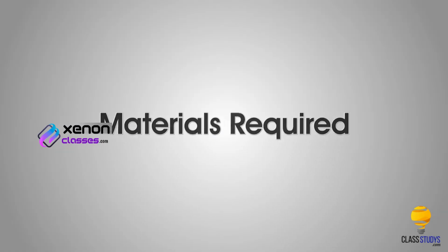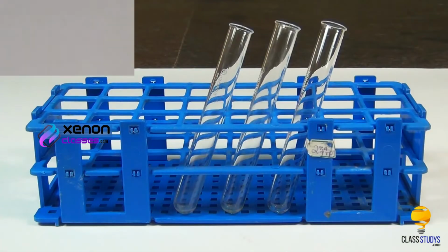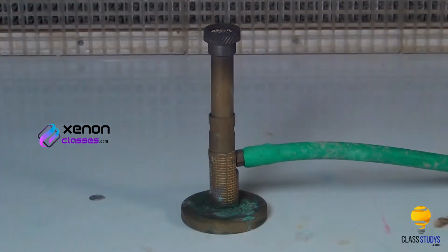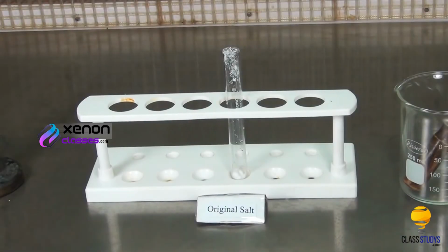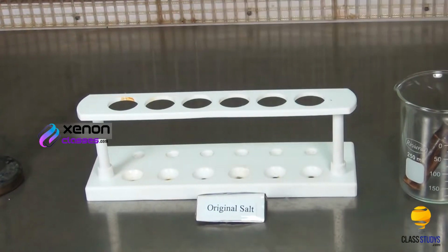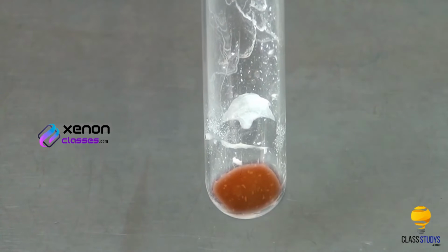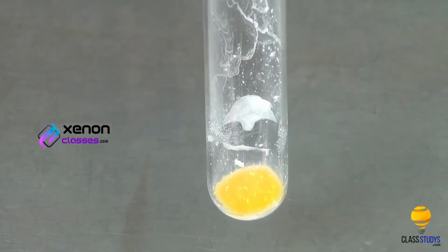Materials required: original salt, test tube holder, and Bunsen burner. Procedure: take a small quantity of salt in a test tube. Heat it over the Bunsen burner. The salt becomes brown when hot and yellow when cold, indicating the presence of lead ion.